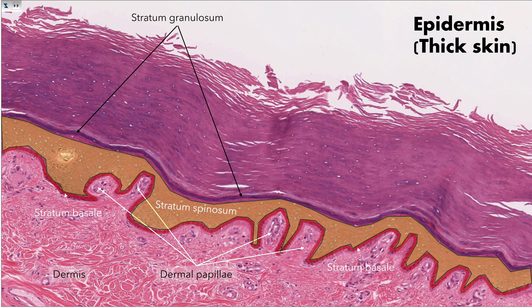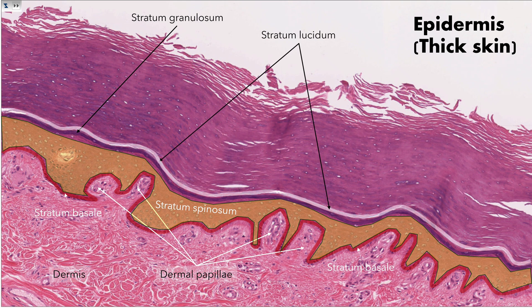The stratum granulosum is the next most outward layer. It is composed of three to five cell layers that begin the process of keratinization in earnest. The lowest layer may have visible nuclei, but the upper layers have usually lost their nuclei. The production of keratin produces a darkly staining layer. In thick skin, the fourth layer moving outward is the stratum lucidum, which is not found in thin skin. The stratum lucidum features a lightly staining layer of two to three cells. It is undergoing an intermediate step in the process of keratinization, producing a protein intermediate called eleidin. Eleidin does not absorb most stains and appears lighter than the other layers.